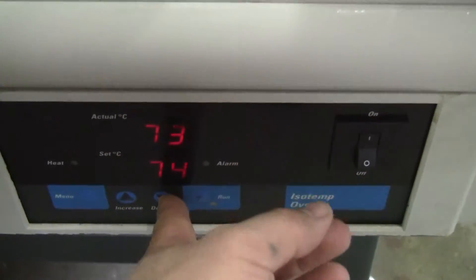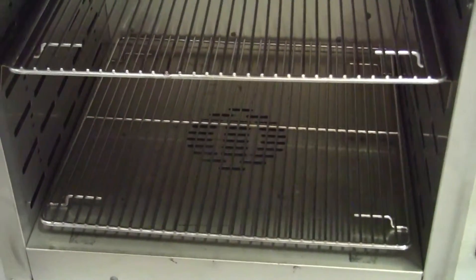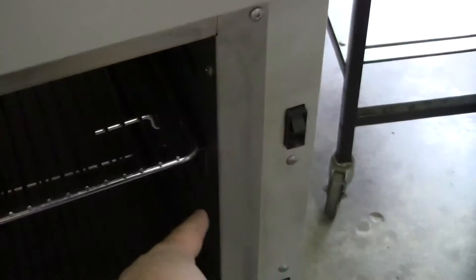I can increase it and decrease it at will. Inside, it's clean. Please indicate whether you need another rack — there's a rack sitting on the bottom, that's what they were using it as. Door seal.